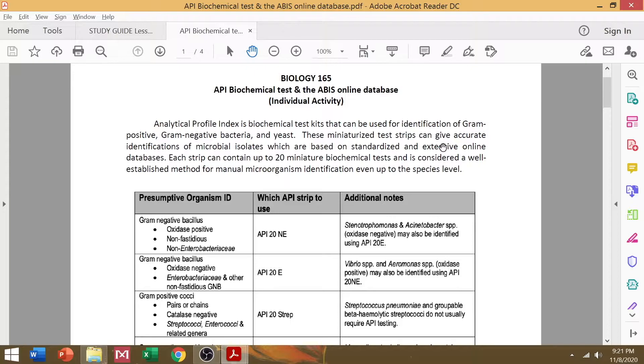And usually, when using this method, you can compute and obtain a certain profile number or a code for your isolates. But sadly, we need access to that online database, and that does not come free. So that's why we're opting for an open source database like your ABIS database.